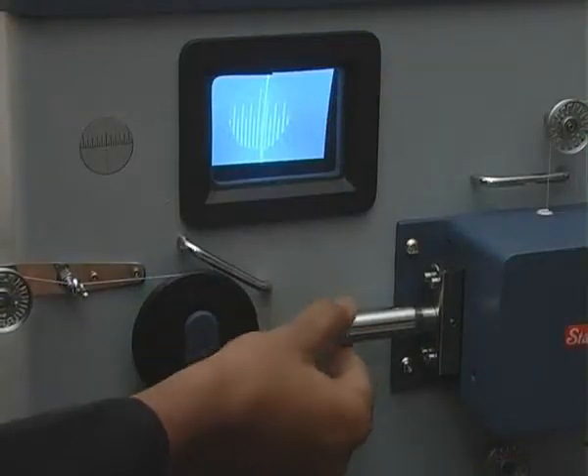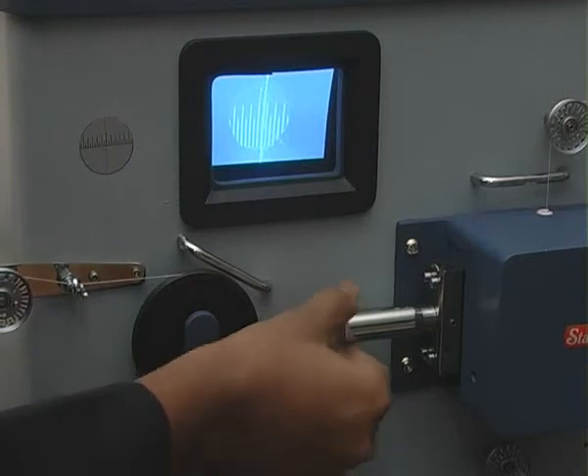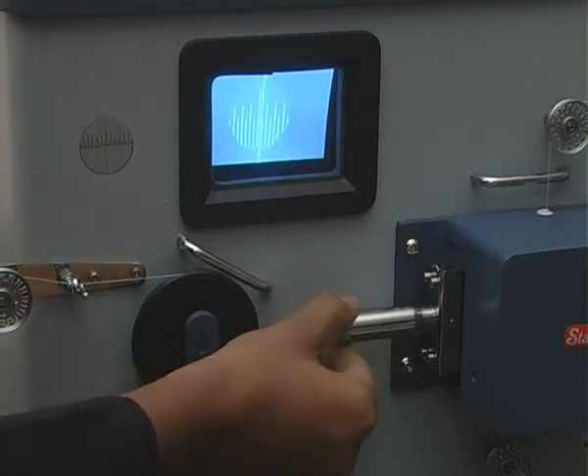The zero line can be easily adjusted with the help of an adjustable knob and the video display unit.